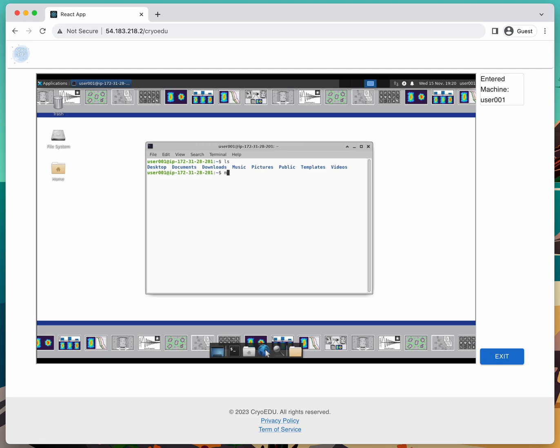So for this example, we're going to make a new directory with the command called mkdir, and we'll call this first try. Click enter. And now if I relist this directory, you see there's a new directory called first try. It's important to keep your Relion simulator runs separate in different folders.